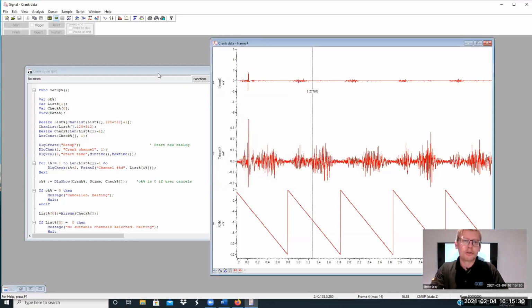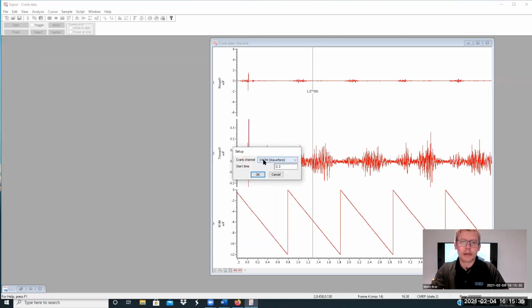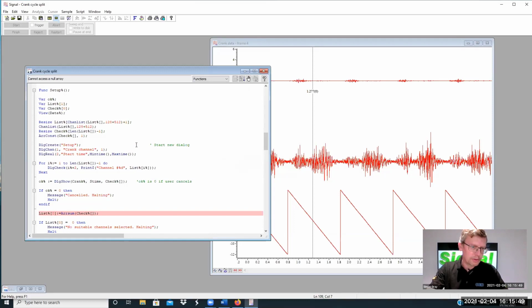So instead, utilizing a script here, I'll let it run. It asks me which is the crank channel, because we can't tell necessarily from the channel titles. I give it a start time into the file, and I say, okay, so this is all written by you or I. Oops, I did that.